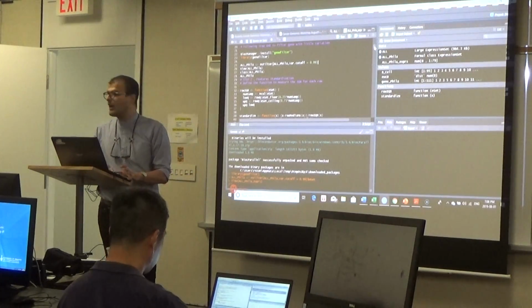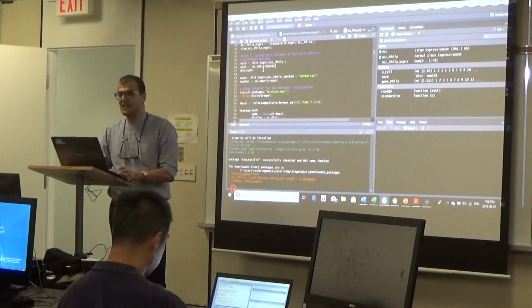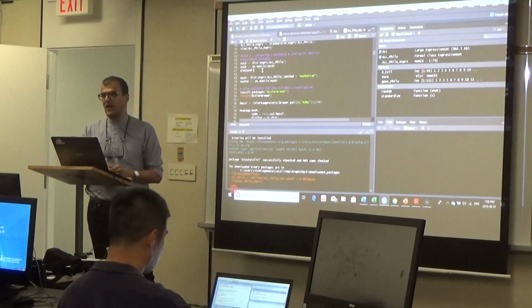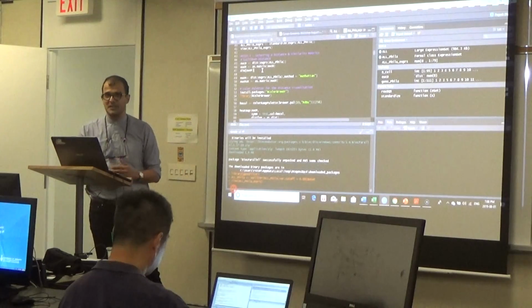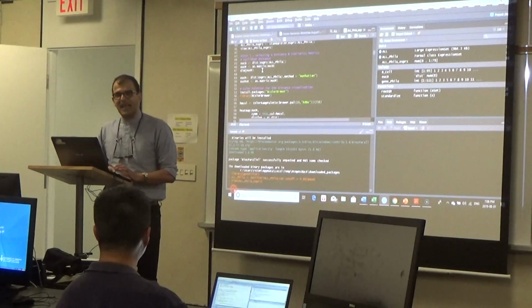But if you have the gene expression profiles, it should just work, for example, go to this line. You can see the result. I cannot show you the result, but if you have the gene expression profile, it should work fine. And after, we go on to write the first machine learning algorithm, which I can join you at that step.